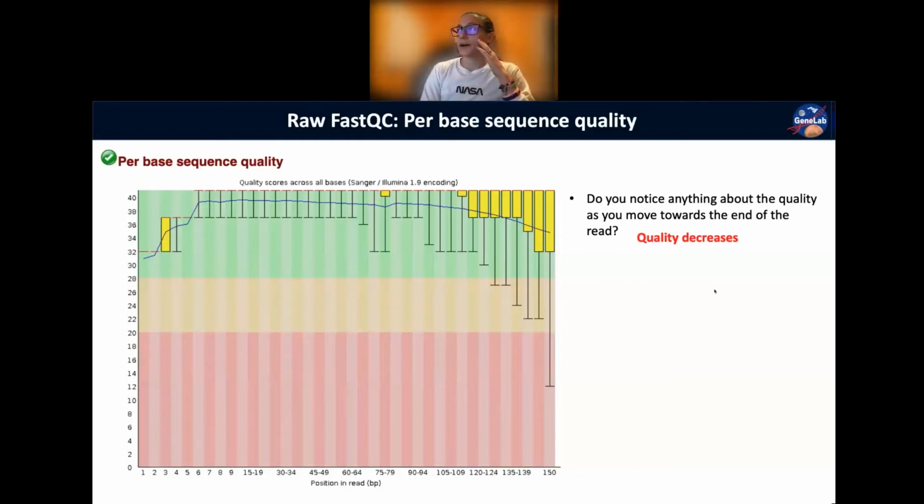We haven't quite made conditions as ideal as they are in our bodies. So the polymerase will work for a while. It'll go through and sequence your read as it goes, but it's going to eventually fall off. If it does fall off, you'll tend to see poor quality at the end of the reads for that reason. That was what Elba was alluding to.